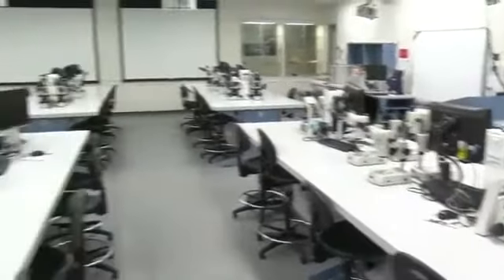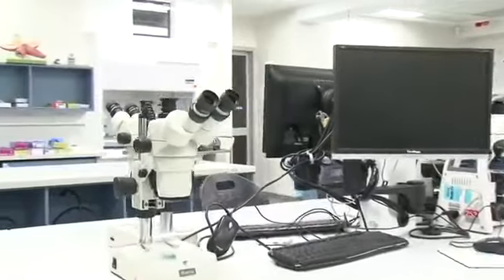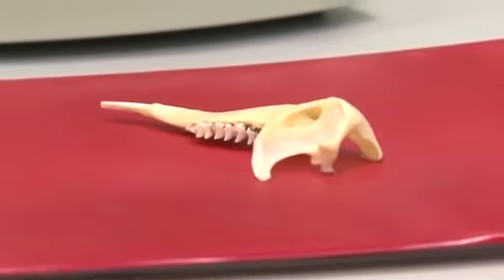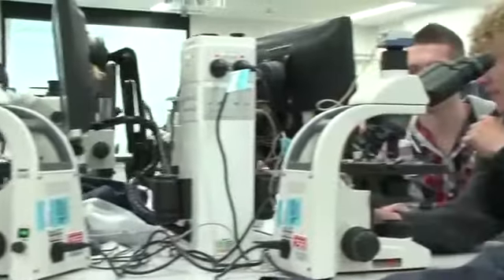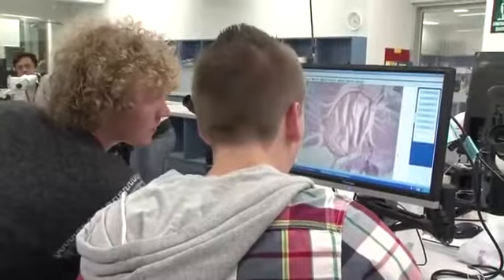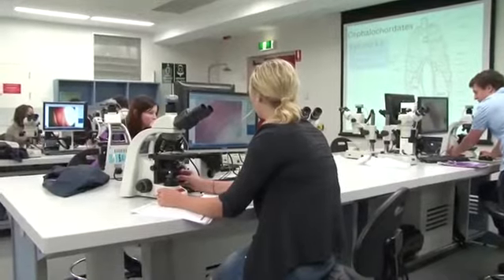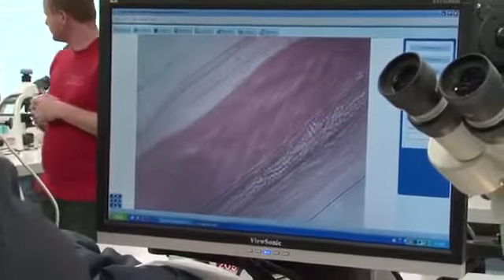The 4 labs each have 16 student computers connected to biological and dissection microscopes via a camera system, which can also be attached to a boom arm if larger samples are being studied. Pairs of students work at these stations, enabling them to share knowledge and insights with each other and the pair of students directly opposite. The digital aspect of education is well integrated into the student learning experience.